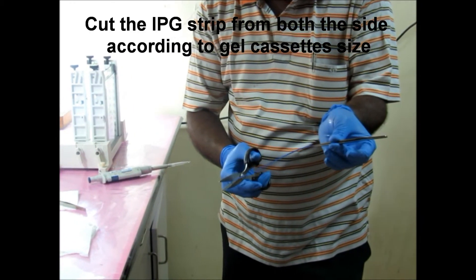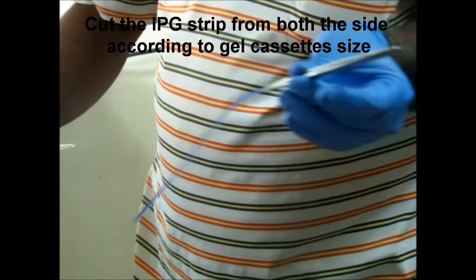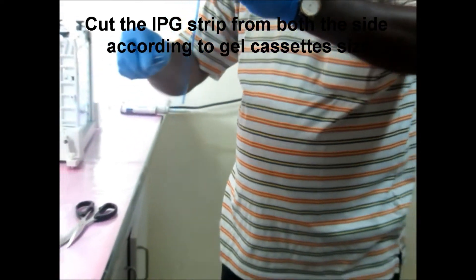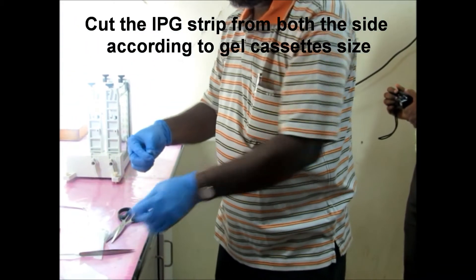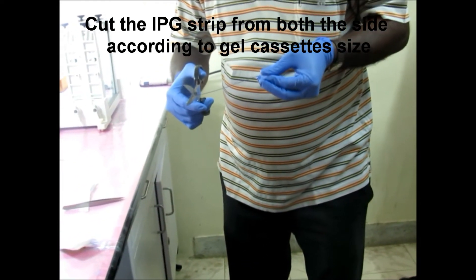Cut the IPG strip from both sides according to the gel cassette size. The IPG strip is cut with the help of scissors. Both the anode and cathode sides are cut.